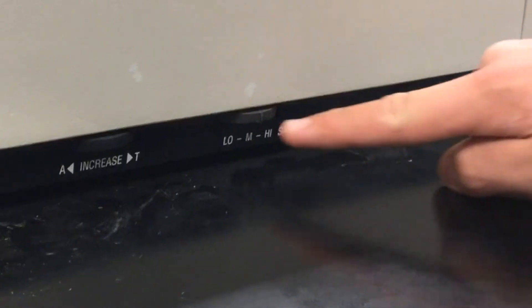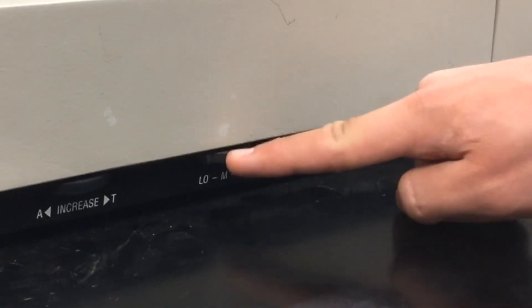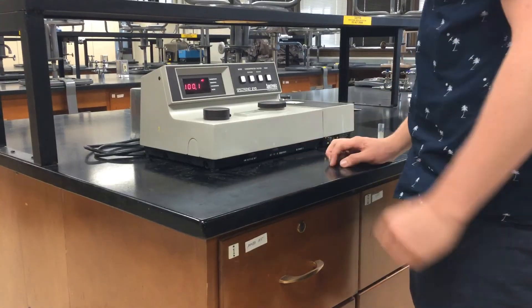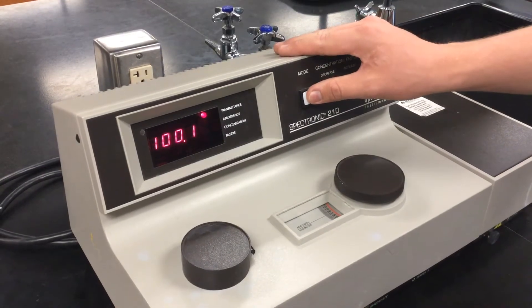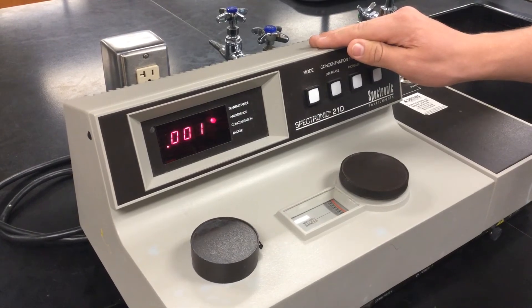If you are unable to have your transmittance read 100 percent, try adjusting the sensitivity dial. Press the mode button on your machine so it is now reading your absorbance. If you calibrated the machine correctly, this should now read zero.